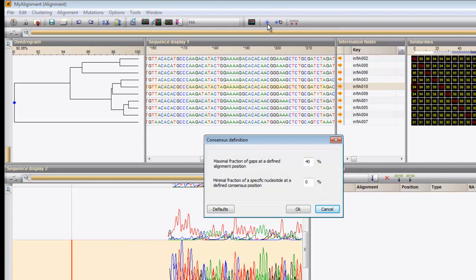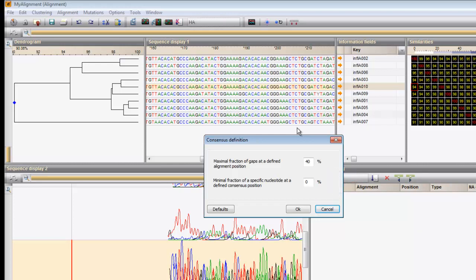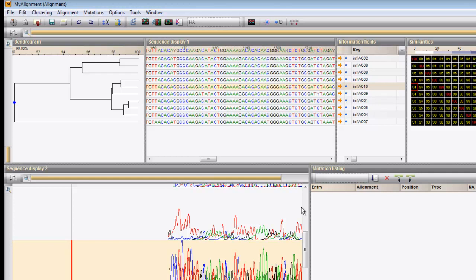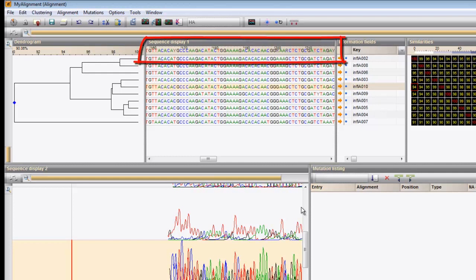We are prompted to specify two settings. If the maximal fraction of gaps at a defined position is higher than this percentage, the position will be excluded from the consensus sequence. The minimal fraction of a specific nucleotide at a defined consensus position defines the threshold occurrence that a nucleotide should reach in order to contribute to the consensus. I can set this, for example, to 20%. The consensus sequence is displayed in the header of the first display panel.